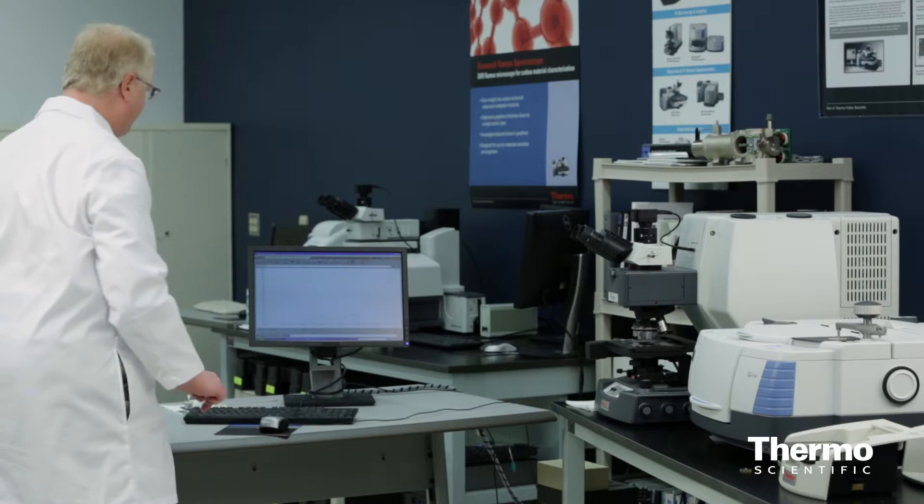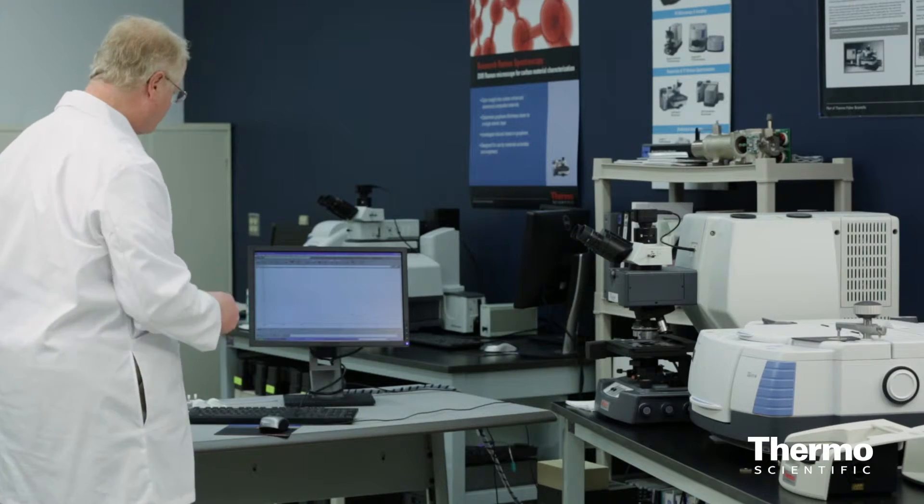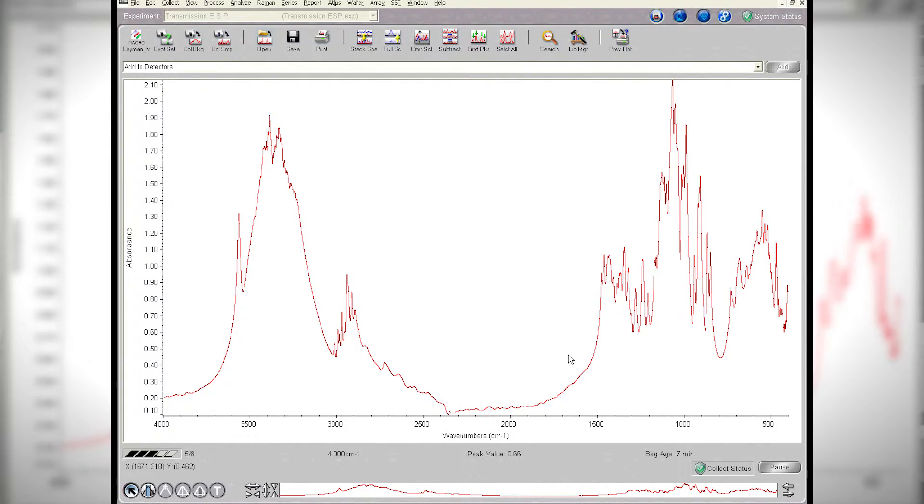As I said, I've already run a background. So now we'll begin scanning, and when it gets to the fourth scan, you'll see the spectrum of the material appear. Then when it gets to eight, it'll complete the scan.